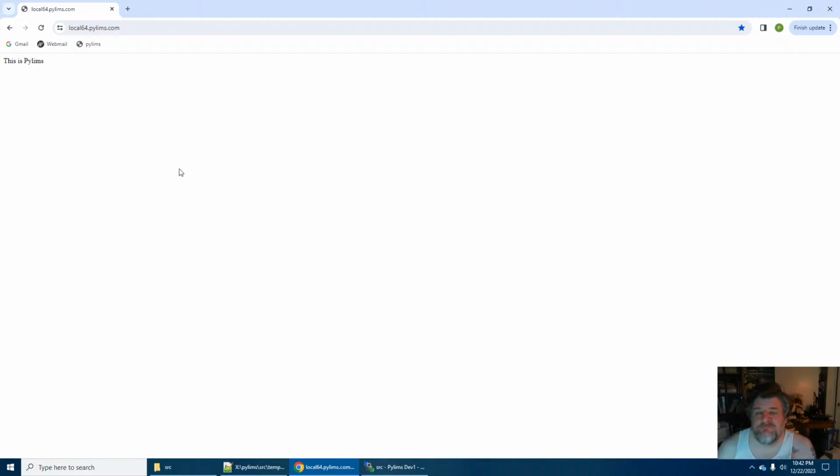Okay. What's the first thing we need to do? We need to do some things. There's a lot to do.